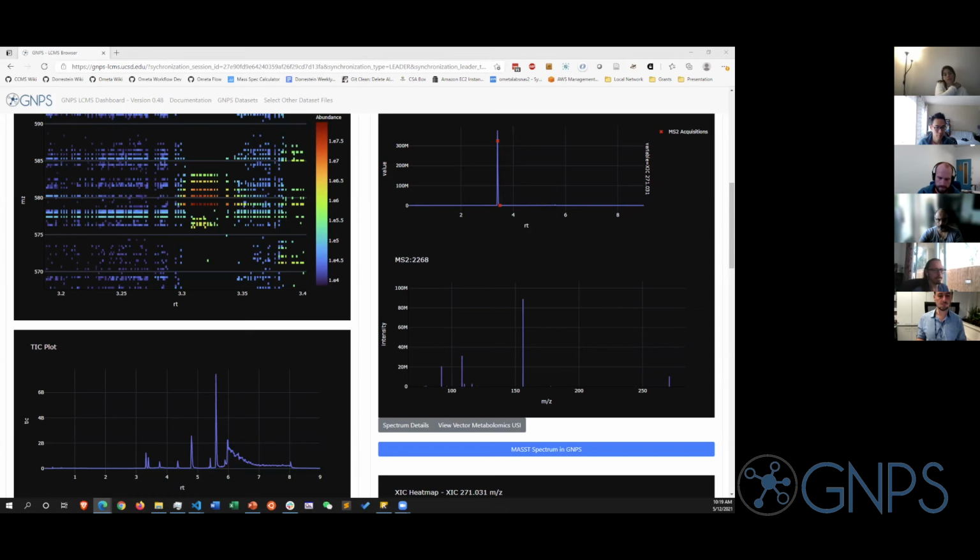Yeah, one idea that one of my friends, Vanessa Phelan, thought about is if in your sample you see an MSMS and you want to purify it, and it's not produced in very high abundance, you can start asking where else has this molecule, or at least this MSMS, occurred, and that might be produced in a higher abundance. So I can grow that bug instead of my bug that doesn't like to produce it very much. So I thought that was kind of interesting, at least to me, a really great application.